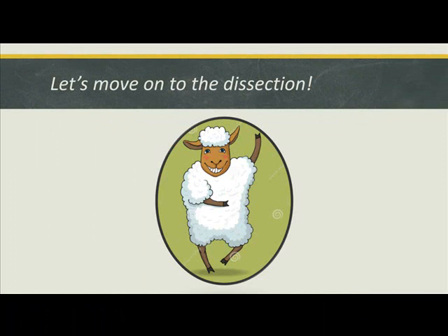Woohoo! Let's move on to dissection. For the following part of this movie, please wait for directions from the instructor before making any cuts. The instructor will pause the video and give any necessary further instructions before any cuts should be made.